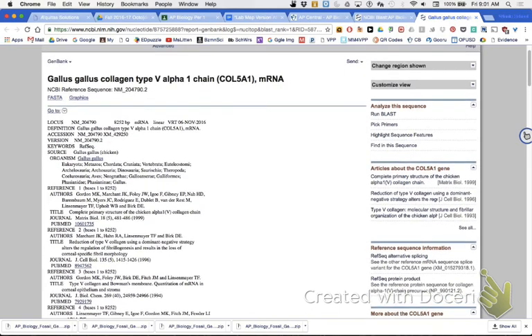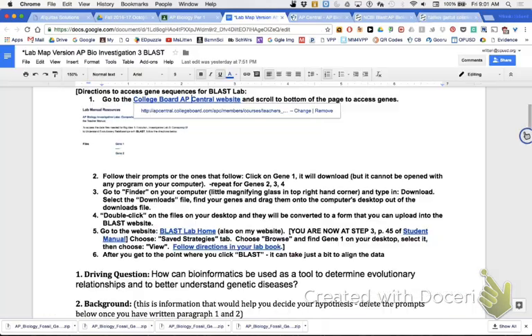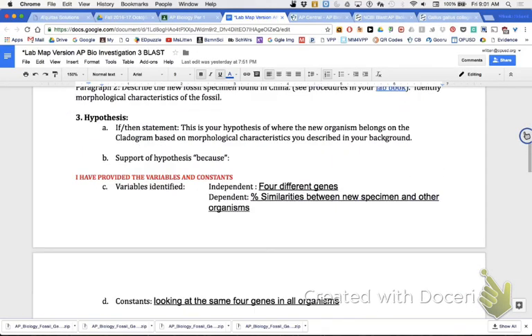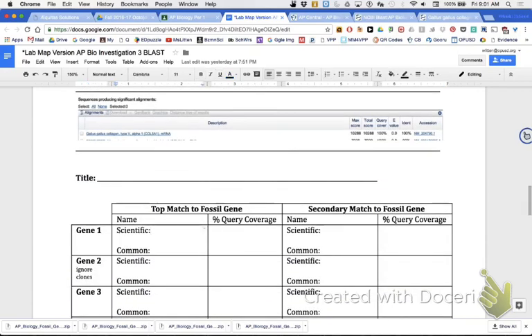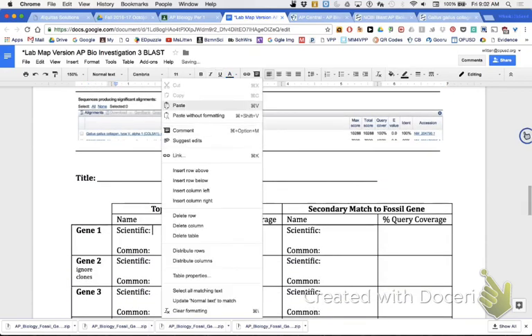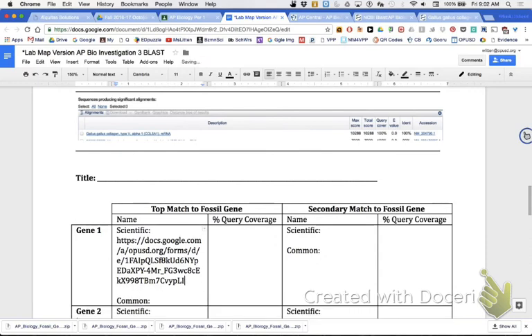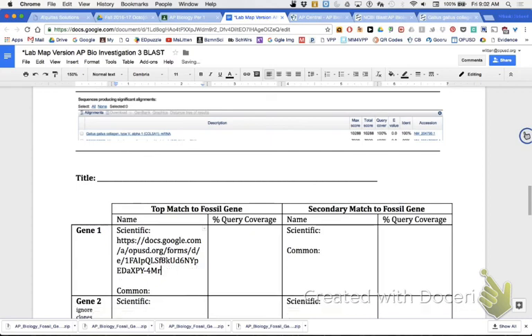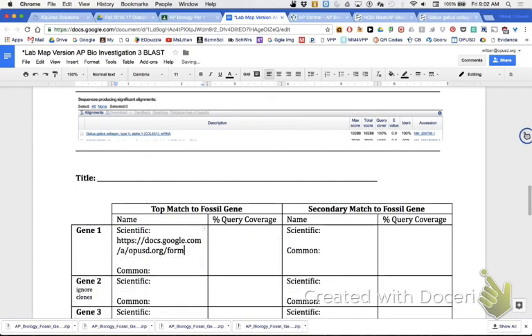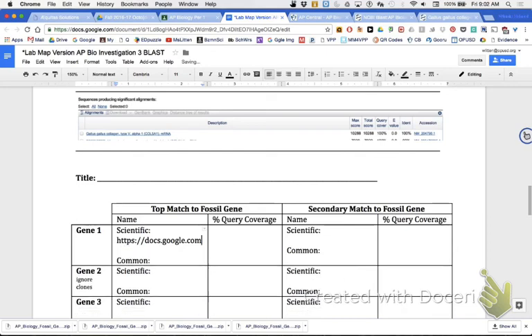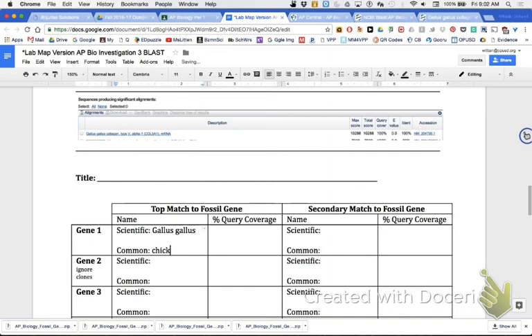Right here, I've asked you to put in your data table, I asked you for its scientific name. So what I would do, this one's an easy one, but some of them are hard. So I would just do this, I would do a copy. And then I would paste that in my lab map. I would go to my lab map and I would go in here and I would put scientific name, gene one, paste. I would write the scientific name and then I would write the common name, which was what? Chicken. And then what was the percent coverage? So I put 100%.